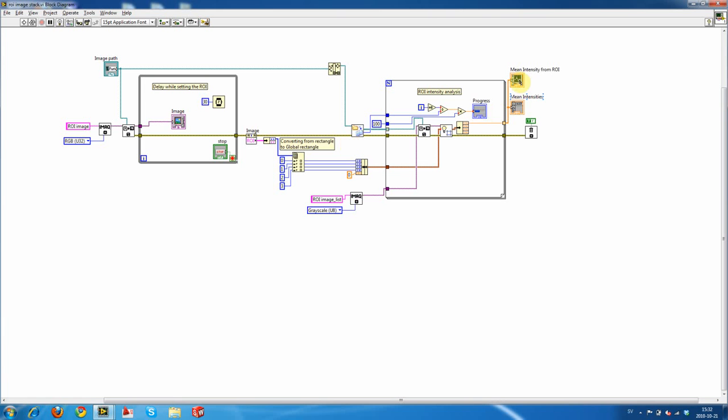And that's all this is doing too. This is a simple graphing program that takes the index number and the number that you assign to it and makes a very simple line graph. And that's all this program does. It's a quick little program to show you how to analyze a stack of images instead of a single image, which introduces this use of for loops and indexing functions, both input and output.